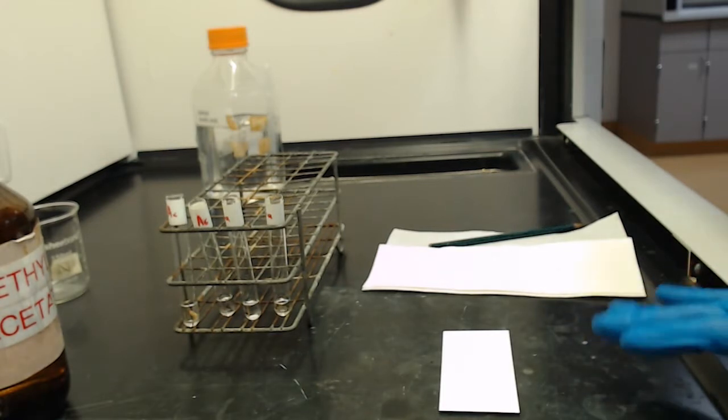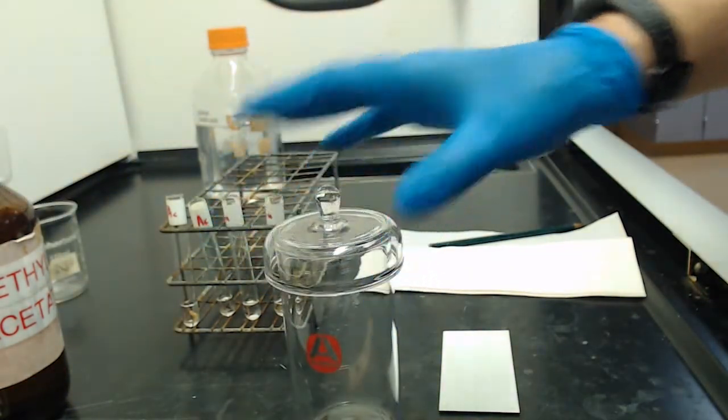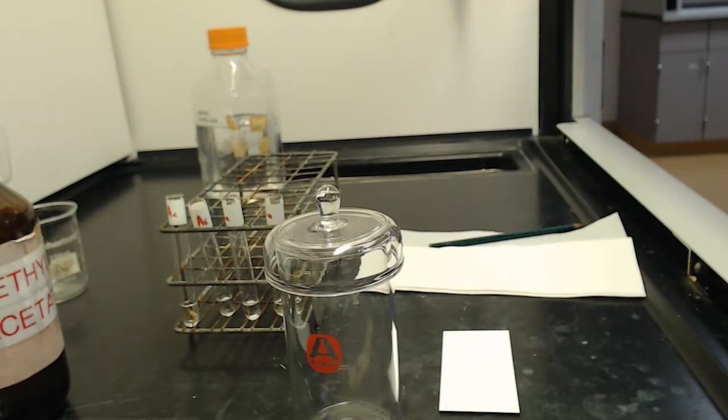This needs a few seconds to dry, but while I'm doing that, I can set up my TLC chamber. In this video, I'm going to show you two different ways to do TLCs in case your lab does not have a TLC chamber. For the first one, I'm going to use the TLC chamber, and then I'm going to use the makeshift one for the next one.